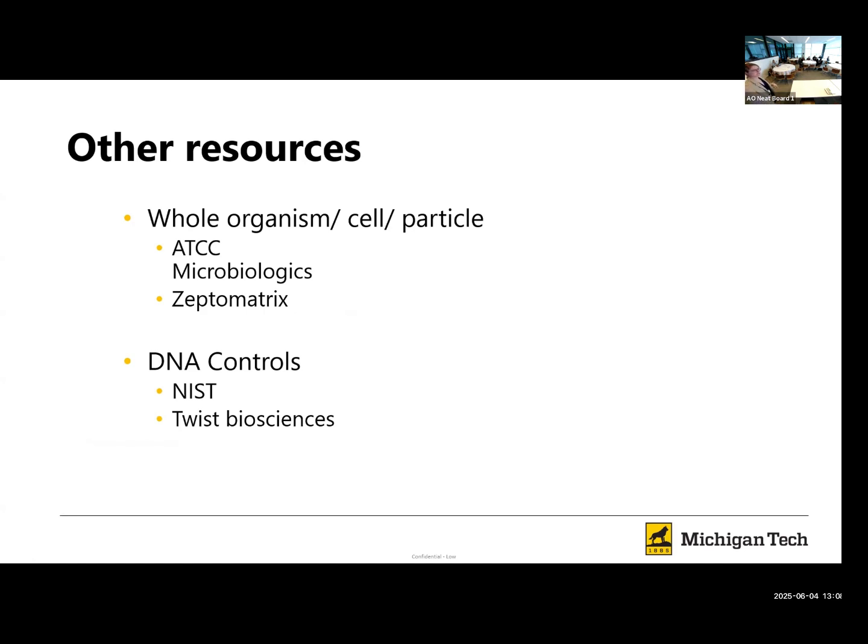You can also think about DNA control, so you can make your own. It's a little bit more recommended that we might all start from a known quantified material so that you can check that you're getting the same numbers that everyone else is, which is especially important as you do your calculations for your reporting, because that's where we find huge errors: the way we're doing the math is not consistent. And that has huge implications for making comparable data. The math arguably should be the easy part, because you can redo it. Okay, that's all I wanted to touch on.